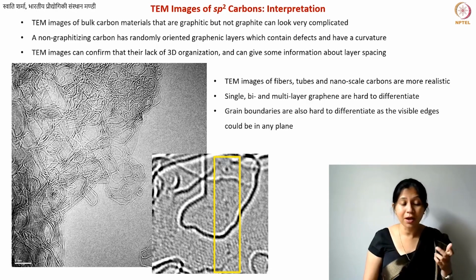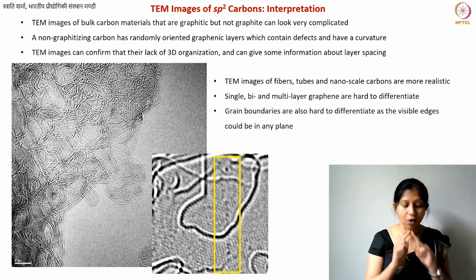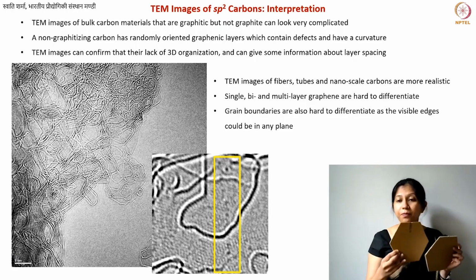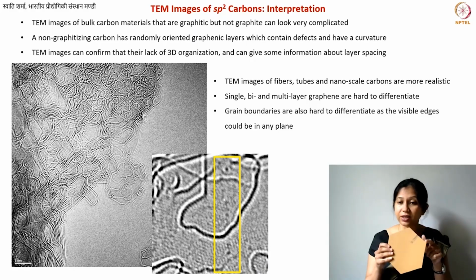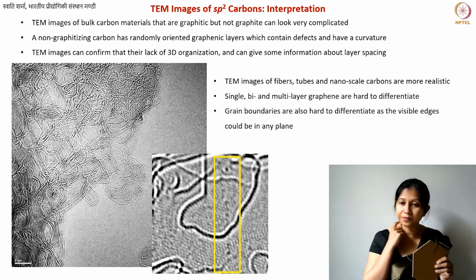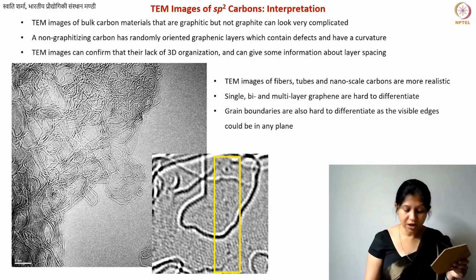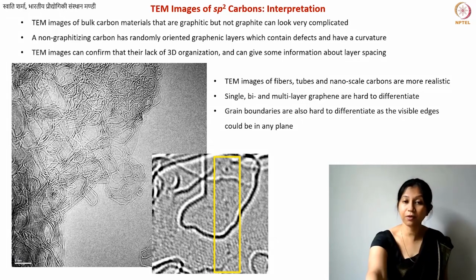But at the same time, we can never be sure if this broken line exists in just one plane, or there is some other graphene plane which is far from your original plane, but has some defective edges. It is common in graphene and graphene-like structures to find edges which have a lot of unpaired bonds, which basically means that you may have a defective edge which is far from your plane. So just be careful with these things.